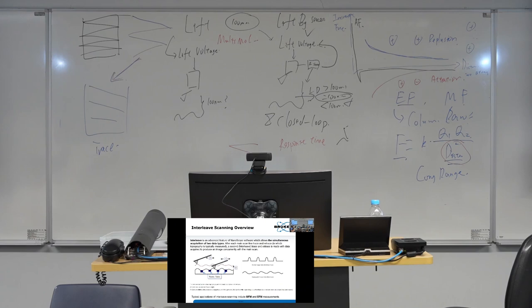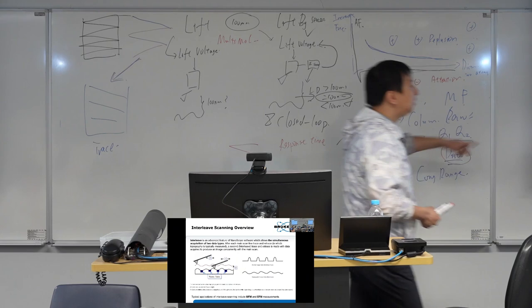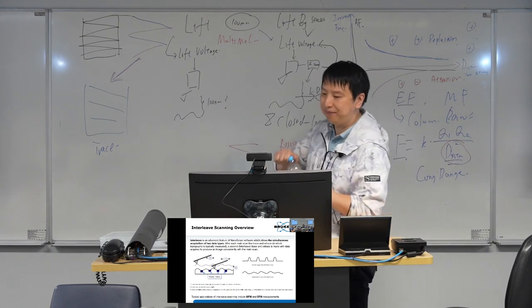So in our lift scan, we do it this way. First, get the morphology, the main scan. On the second, the lift scan, it follows the same trajectory, and as such we control the distance to be the same. So we get the interaction force at each point with the same distance. Okay, that's the idea of our lift scan.